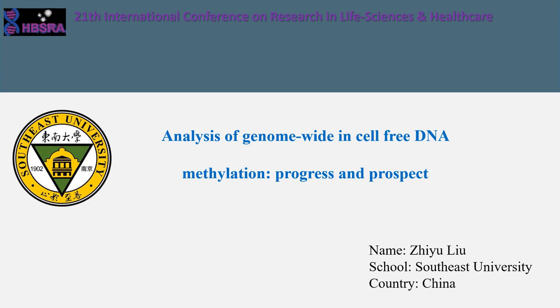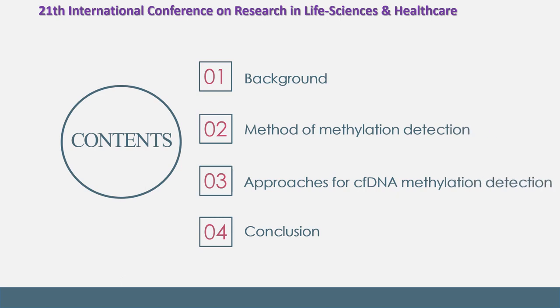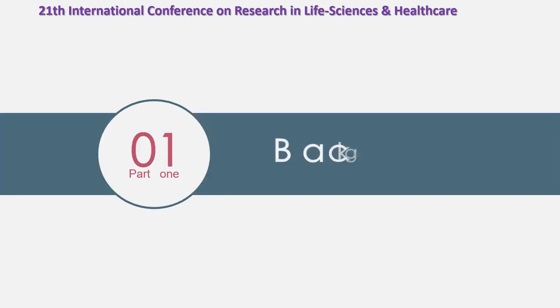The paper I want to share today is analysis of genome-wide cell-free DNA methylation: progress and prospect. I will talk about it from four main aspects: background, methods of methylation detection, approaches for cell-free DNA methylation detection, and conclusion.